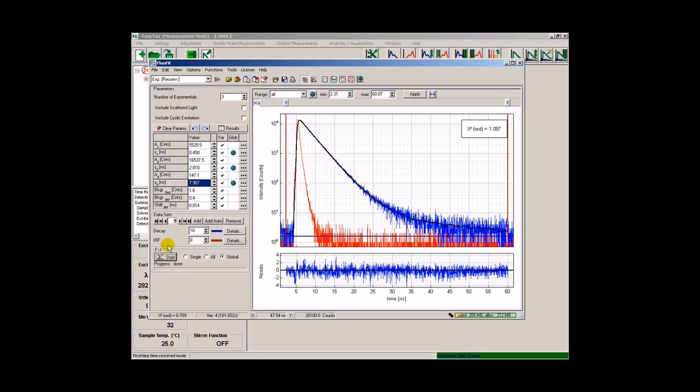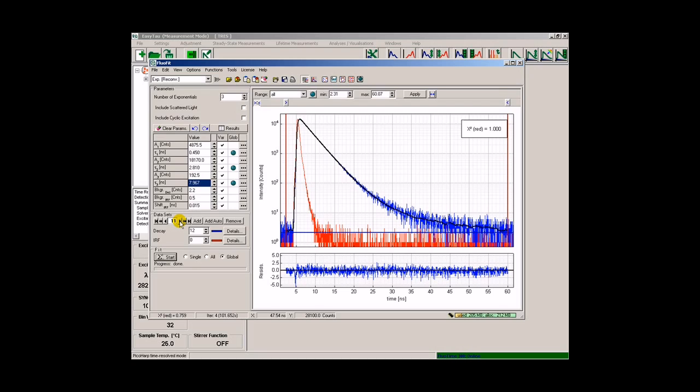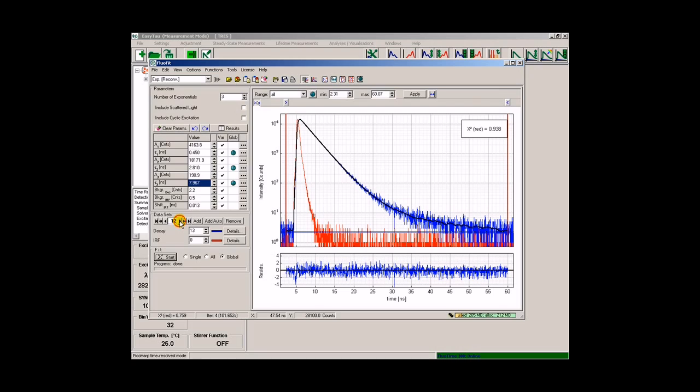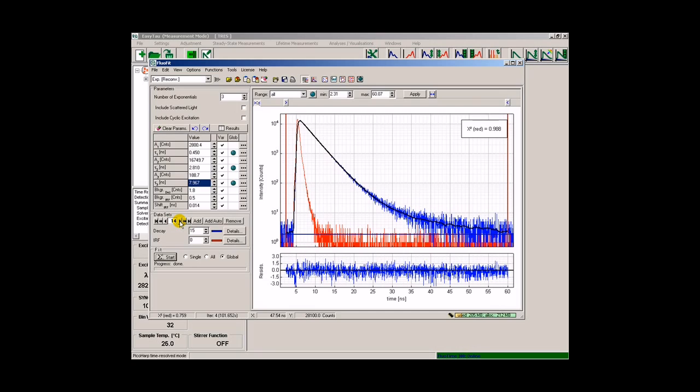After the fit has finished, we can browse through the dataset and judge the fitting quality based on the residuals displayed for each of the decay curves of our dataset.